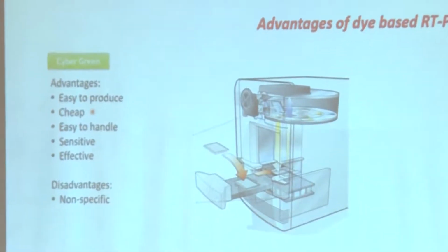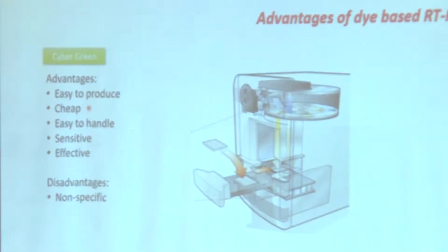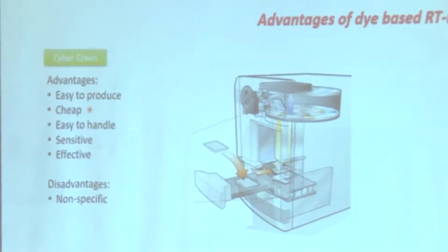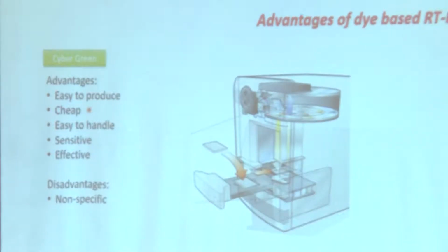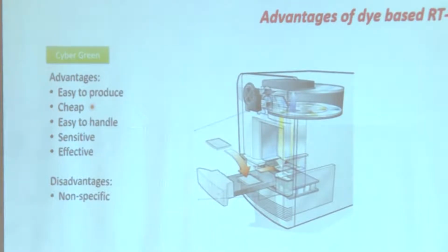What is the disadvantage? By chance your primer is a wrong primer. For example, the primer is not very specific, correct? Possible, no? Instead of targeting the fliC gene, it goes and amplifies something else. In real time PCR, what happens? It does its job, no matter what is amplified. That is a problem. So, that is a disadvantage of this particular technique.